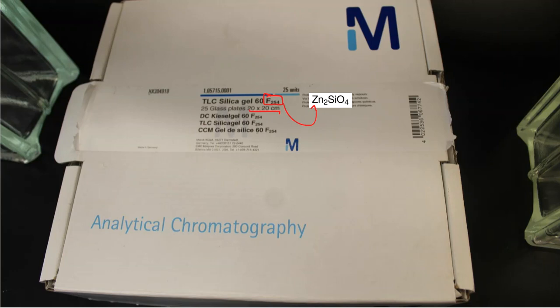And that's not thinking beforehand. I'll talk about what I mean by that in just a second, but here is the box of silica plates that we've decided to use. Of course, the smaller they go, the cheaper they are, but the more you have to use. So in the long run, is it really worth it? Well, not for us. We've just decided to use the big ones instead.